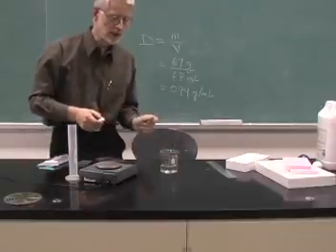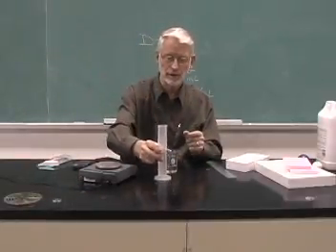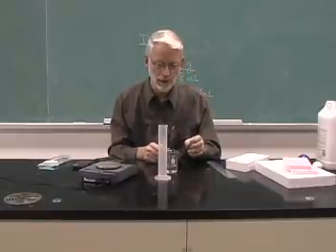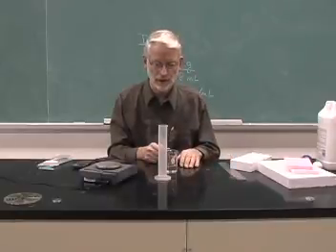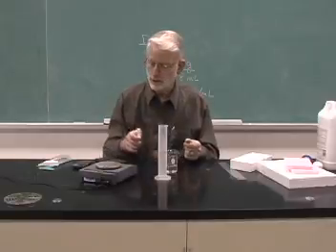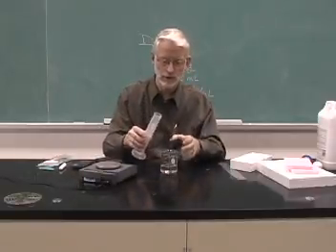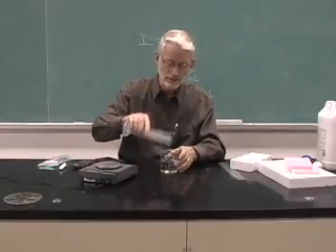And students can take different volumes, more or less than what we have here, and calculate the density, and they will find that the density is approximately the same value every time. And density is thus one property of matter. Whether we have a small amount of water or a large amount of water, the density is the same.